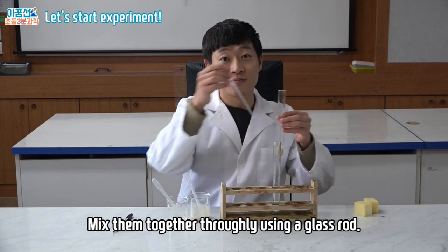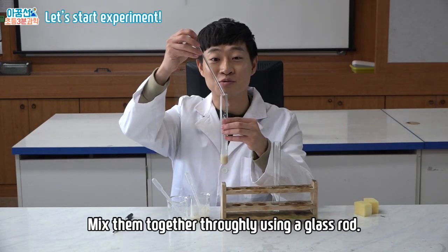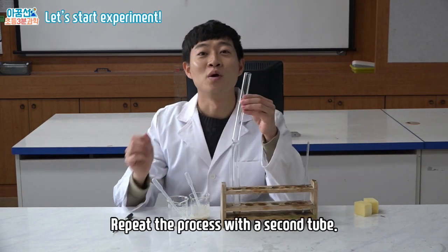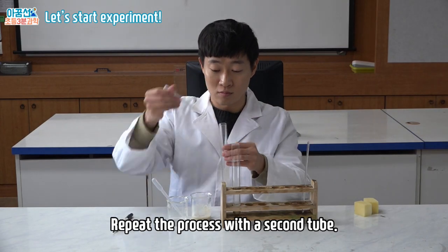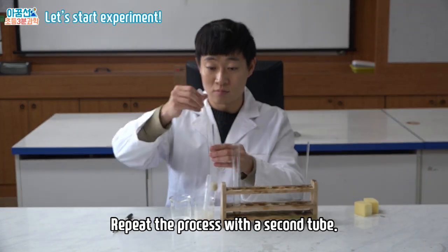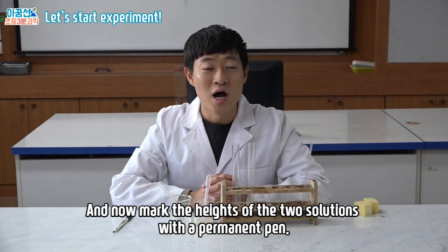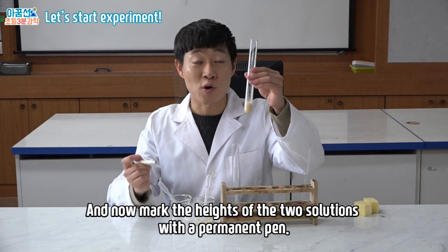And mix them together thoroughly using a glass rod. Repeat the process with the second test tube. And now, mark the height of the two solutions with a permanent pen.